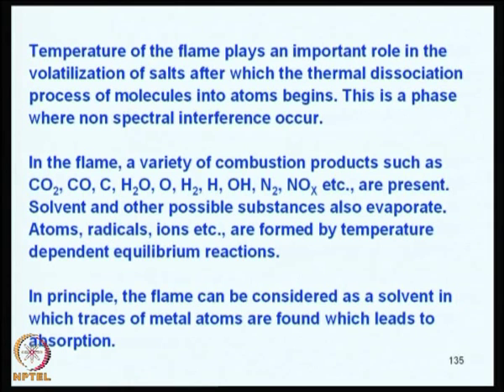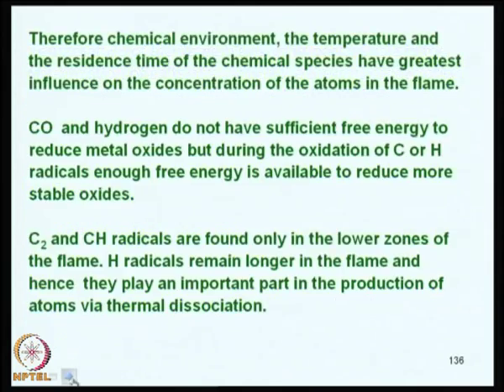In principle, the flame can be considered as a solvent in which traces of metal atoms are found, which leads to atomic absorption. This is the essence of atomic absorption. The flame is a solvent, not in the general sense of a solvent, but it is a medium in which traces of metal atoms are found, which will absorb the radiation passed through them.